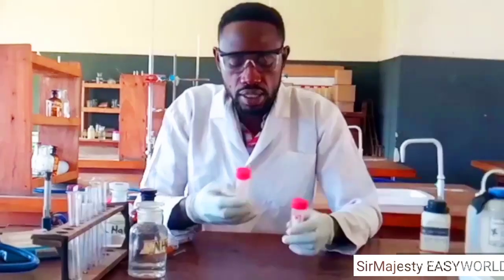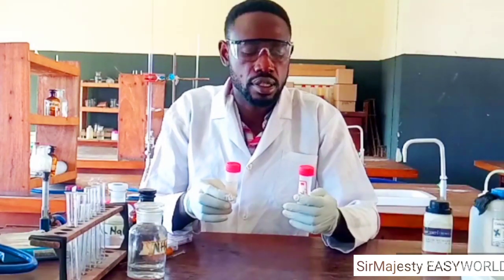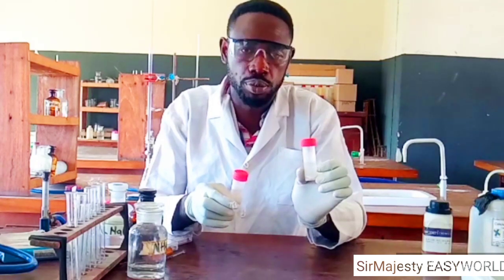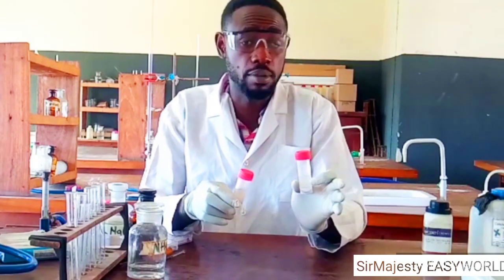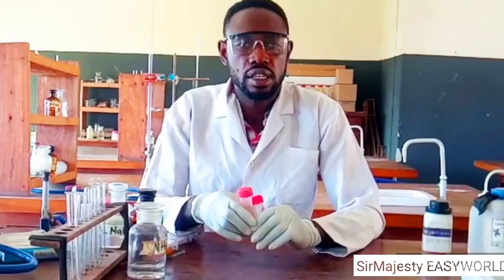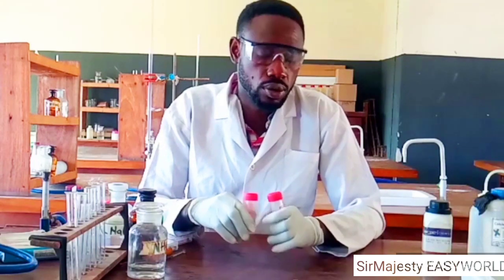First, you should know that these two salts are actually soluble. Lead nitrate, which I have over here, is soluble. Remember, all nitrates are soluble in water, no exception. So if they ask you for any soluble salt of an unknown element, or of an element that you don't know, you just call that element and put it in nitrate. For example, if they tell you any soluble salt of calcium, you say calcium nitrate. So all nitrates are soluble.